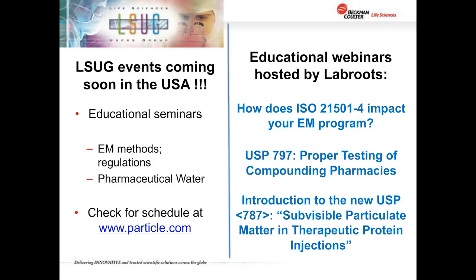You could be painting a car, you could be doing surgery. It doesn't think about that. It just simply says, here's a way to do it, and something that will give you 95% confidence if it's done correctly. And that's the end of that subject. And anything beyond that, whether you're doing sterile, non-sterile, ointments, anything else, is a province of a regulatory demand or GMP, and not from ISO.